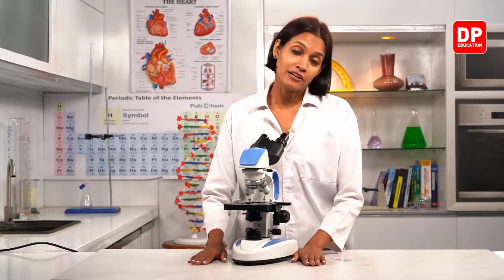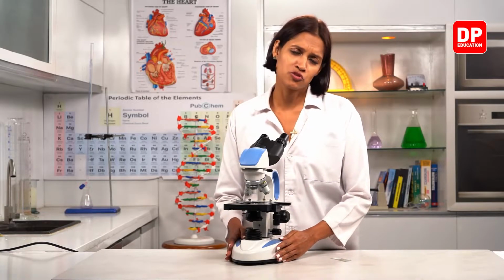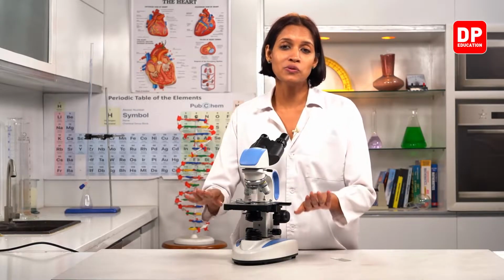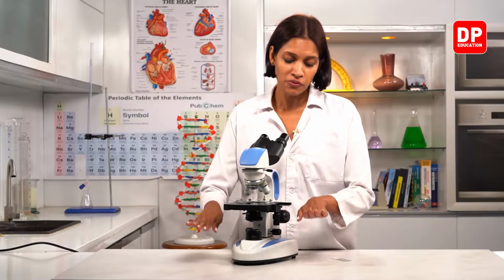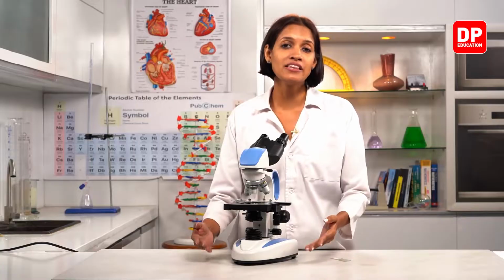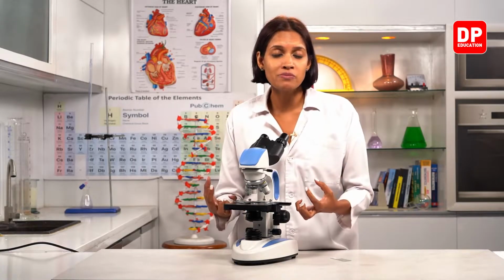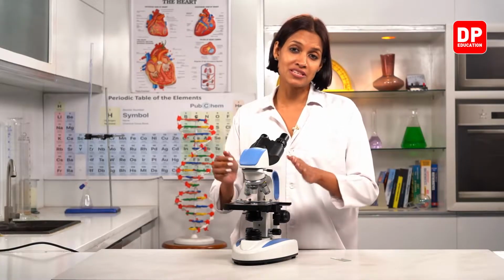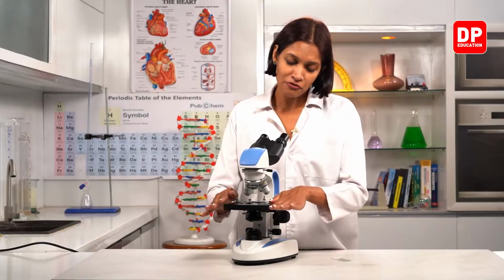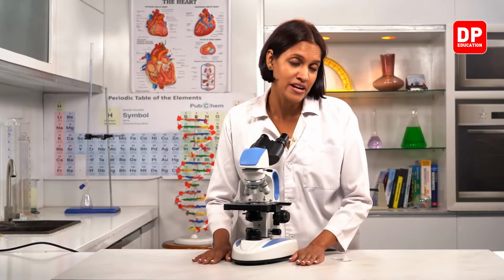Right? What are the reasons for this, children? Then it will not harm the microscope. It might even fall off if we place it on a slanted or an angled surface. Therefore, it is very steady when we place it on a flat surface. And another reason is, let's say you are observing a liquid specimen. In that case, when we use a slanted surface, what will happen? That liquid will spill off. Therefore, in order to avoid that, we have to use a flat surface.